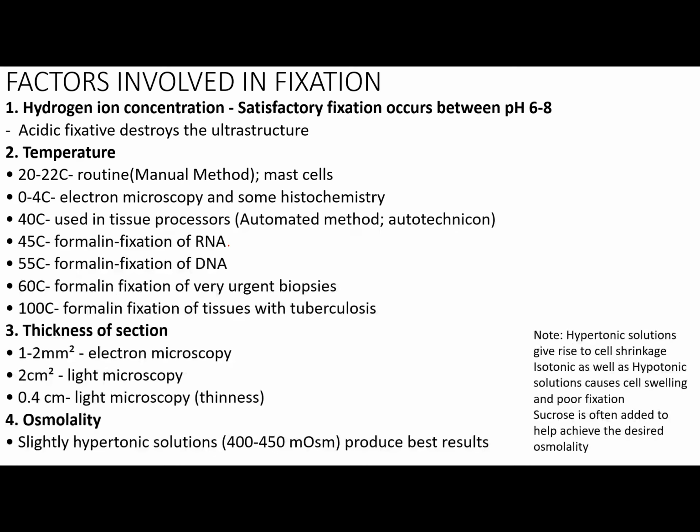Now, what are the different factors involved in fixation? These are the things you need to consider, class, whenever you do fixation. The first one is your hydrogen ion concentration. When you say hydrogen ion concentration, we're talking here about the pH.